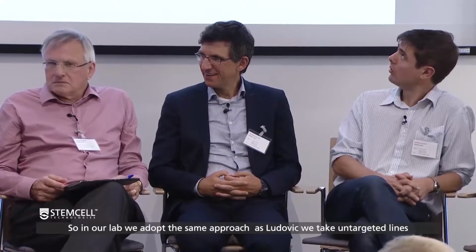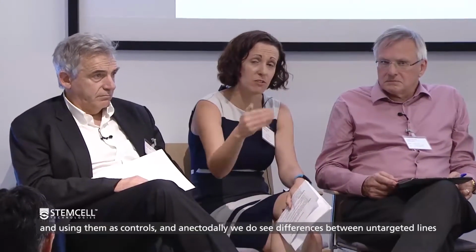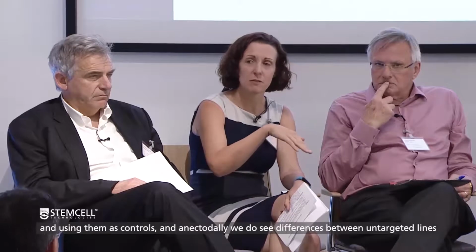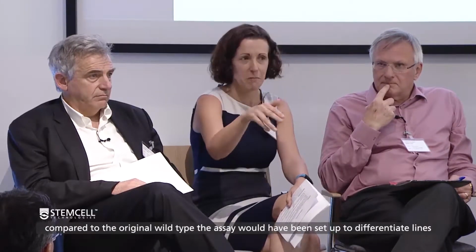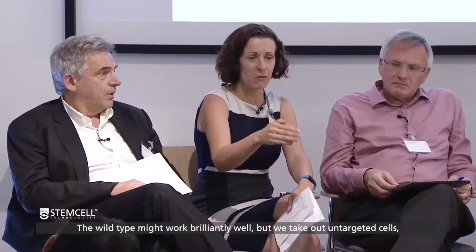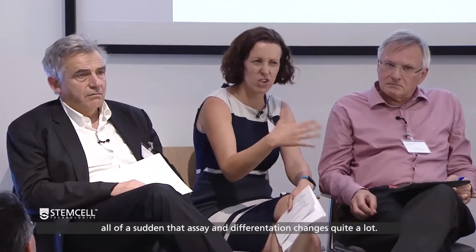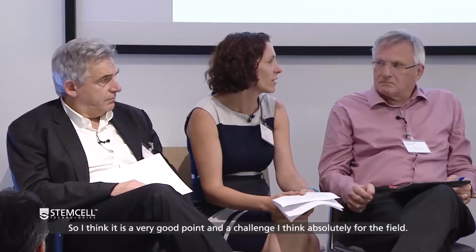So as I mentioned, in our lab we adopted the same approach as Ludovic, taking untargeted lines and using them as controls. And anecdotally, we do see differences sometimes between the untargeted lines compared to the original wild type that the assay would have been set up with. So we're trying to differentiate lines into neurons, for example. The wild type might work brilliantly well, but when we take our untargeted cells, all of a sudden that assay and differentiation changes quite a lot. So it is a very good point and a challenge, I think, absolutely, for the field.